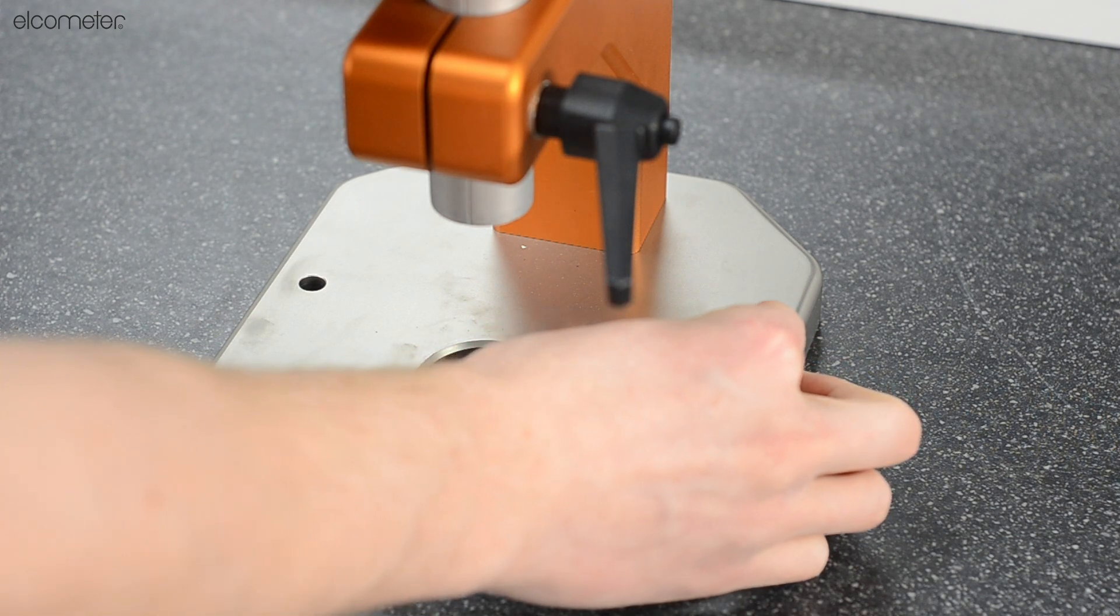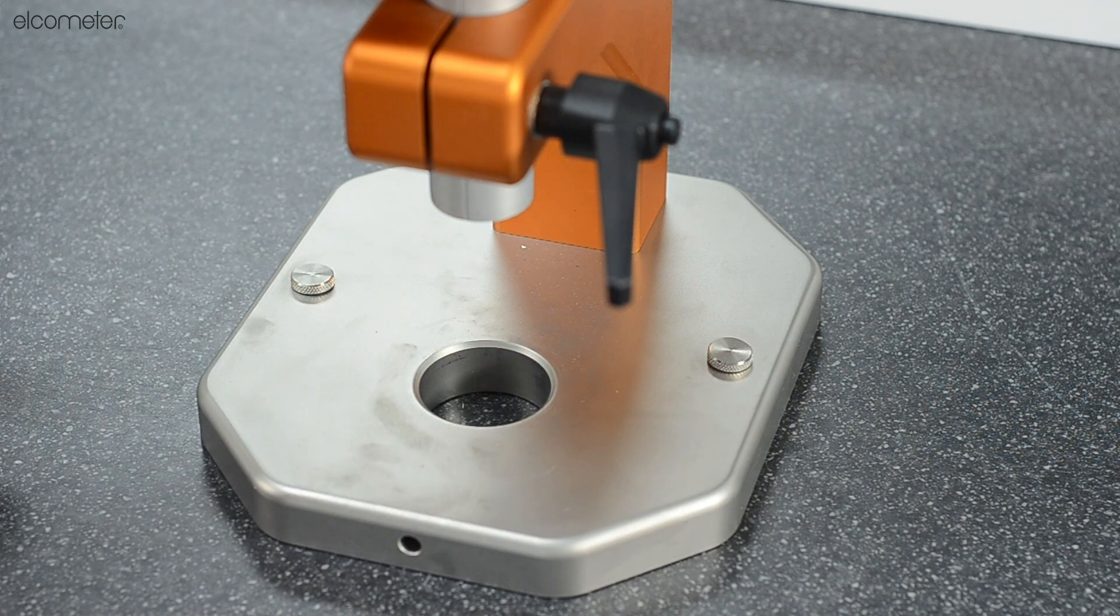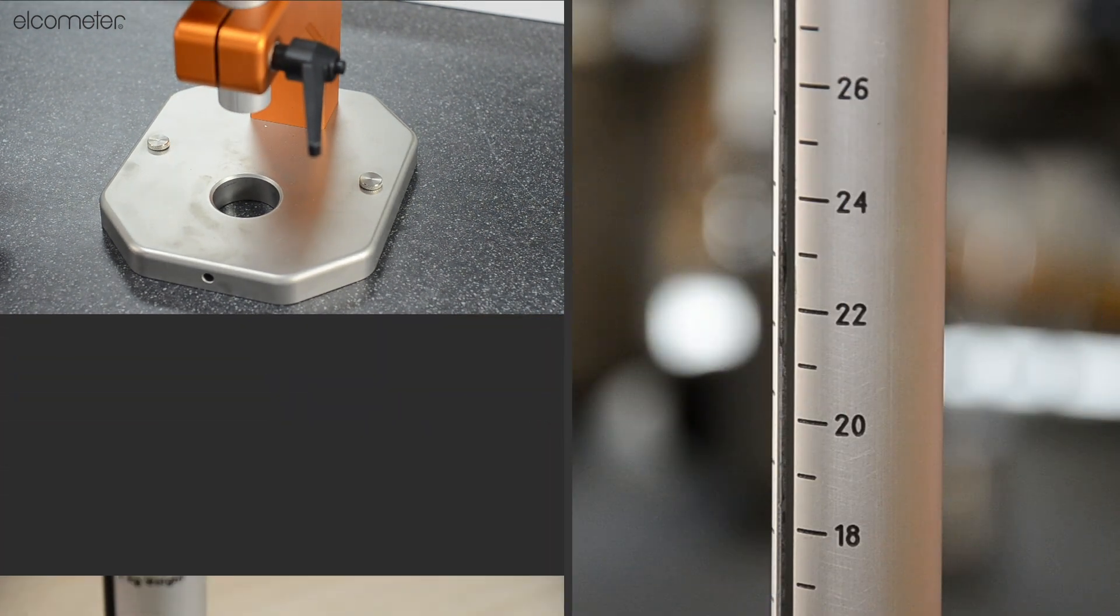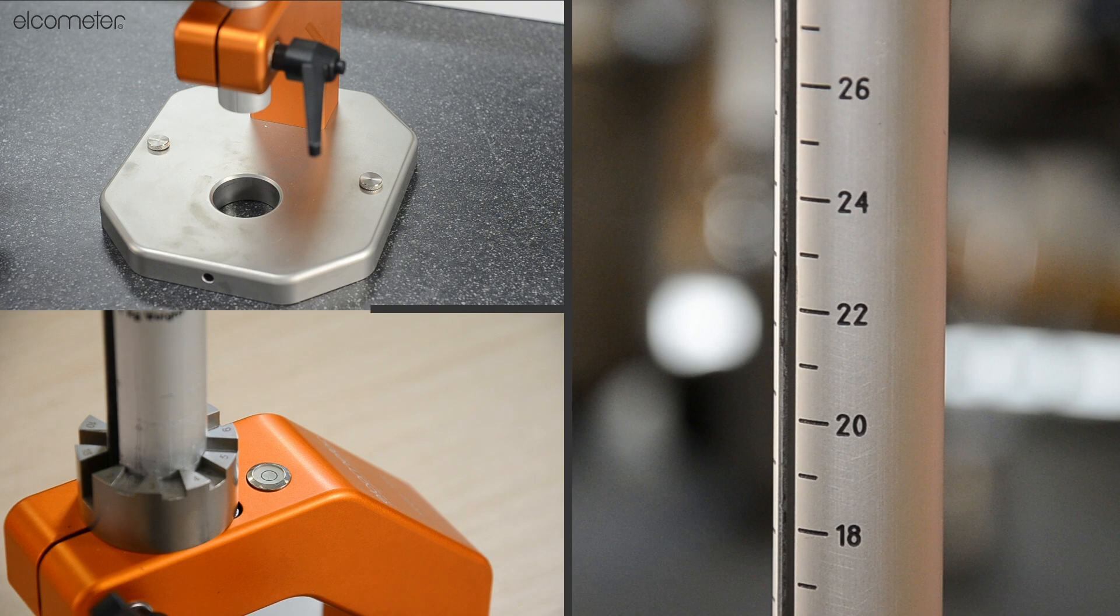The tester's heavy duty base plate features holes to bolt the tester down, ensuring safe operation. Its anodized arm and integrated bubble level ensures stable testing for accurate, reliable, and repeatable results.